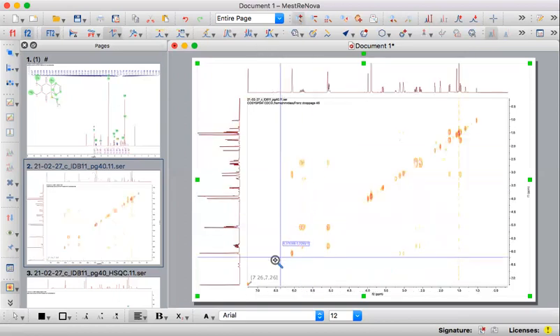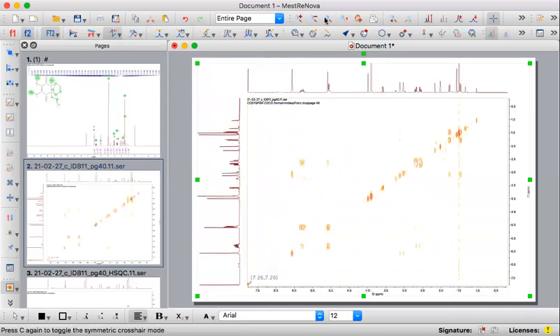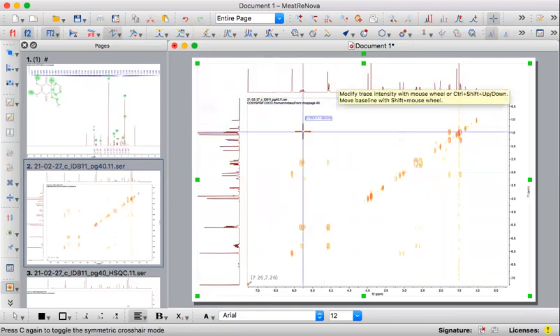If we were to zoom back in on that chloroform signal, we would see that the 1D spectra up here and the 1D spectra over here match up perfectly with that spot in the 2 dimensions now. So we have set up our 1D spectra along the sides of our 2-dimensional spectra. We have done a baseline correction and we have referenced the spectra. Now we go about finishing the processing by doing peak picking.